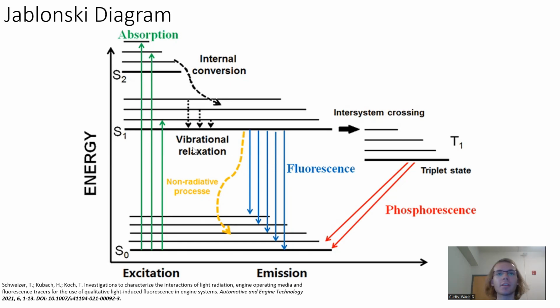While in an electronic excited state, the electron can go through intersystem crossing to enter the triplet state, where the vibrational excited state of the triplet state and the ground vibrational excited state have similar energies. An electron in the triplet state returns to the ground state in the form of a radiative decay called phosphorescence. This phosphorescence is much longer than fluorescence. In this experiment, we are analyzing the decay of the triplet state in naphthalene.